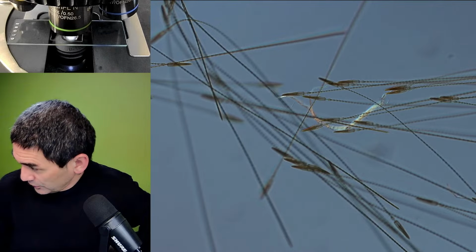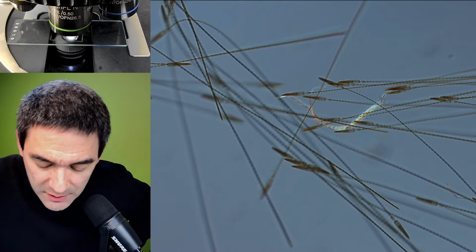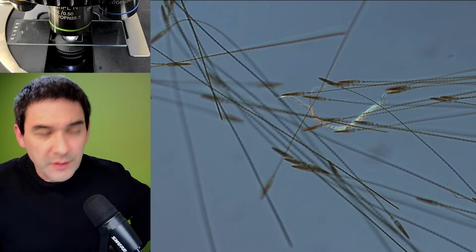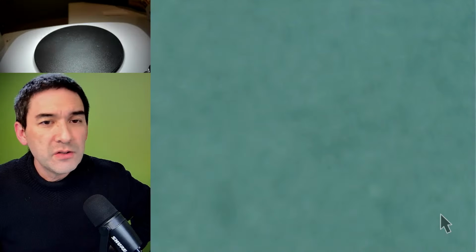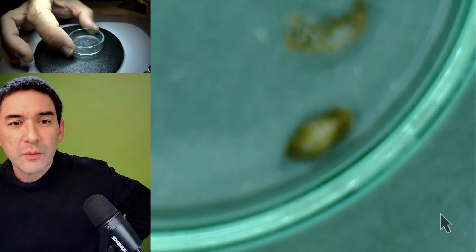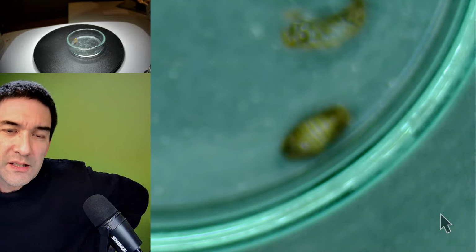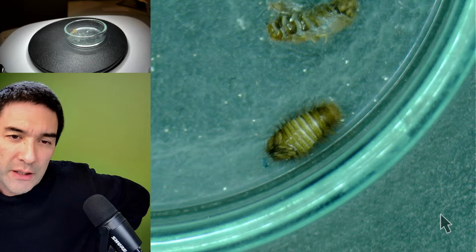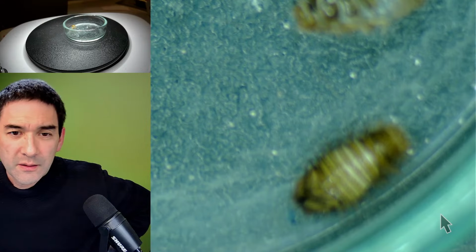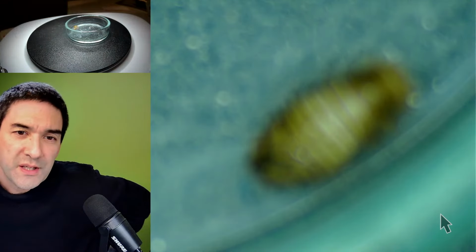And I would like to show you, where did I put it? Here it is. Maybe I can actually show them to you. So I'm going to put it back into the stereo microscope here. Here we go. Every time when it's a little bit out of the light, it starts to fall asleep and roll up a little bit. And when I shine light on it, then it starts moving again. But I want to show you now quickly. I need to focus again.